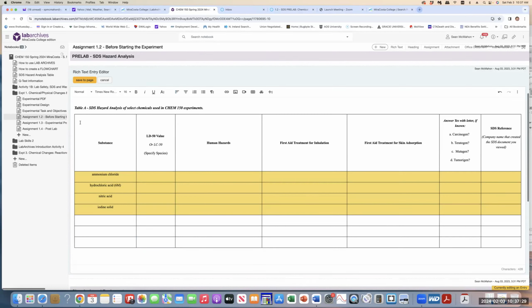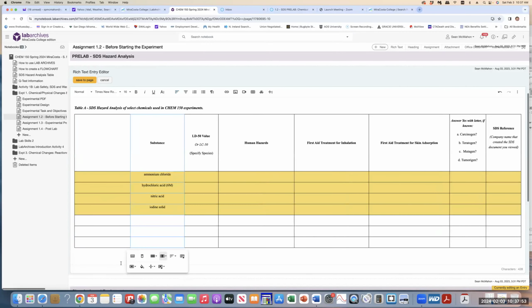working with. Now, in the case of accidentally you removed an entire column, because that can happen. You can highlight a column by accident. And if you go over here on columns, or if you even just hit the delete button, that column will go. So what I want to show you is how you can insert a column if you accidentally delete one. You could just say insert column before.